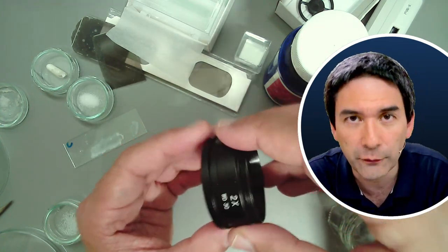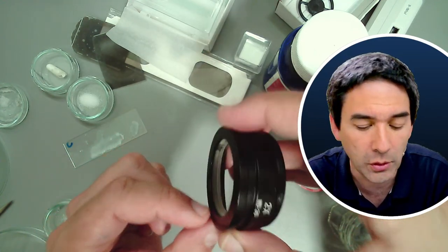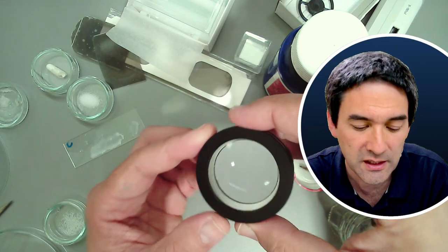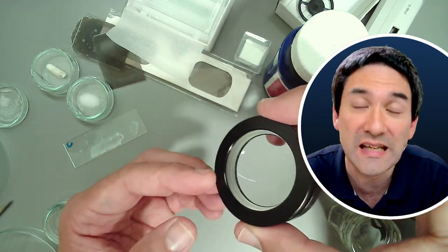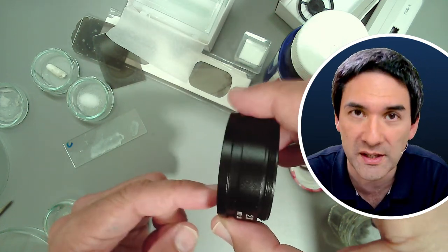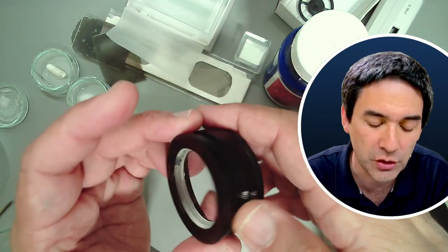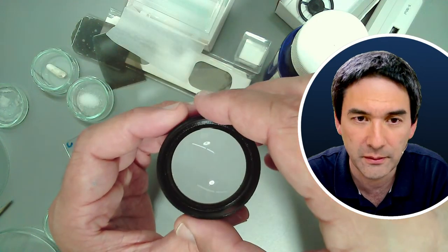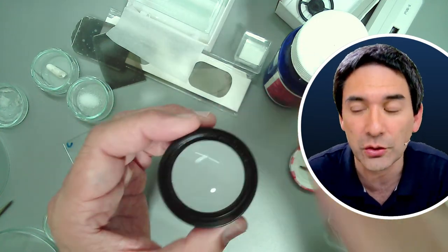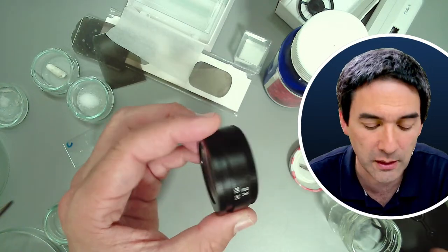You always have to be careful, however, if you have any optical systems or any optics in between, because it could be that those optics also start to depolarize the light a little bit, especially if there are certain tensions in the optics. Then these tensions can depolarize the light. So it's something that you might want to try out in any case, but the advantage is of course that you essentially have a polarization filter which is out of the way and is not really disturbing the sample because it's further away. So that is actually a possibility.